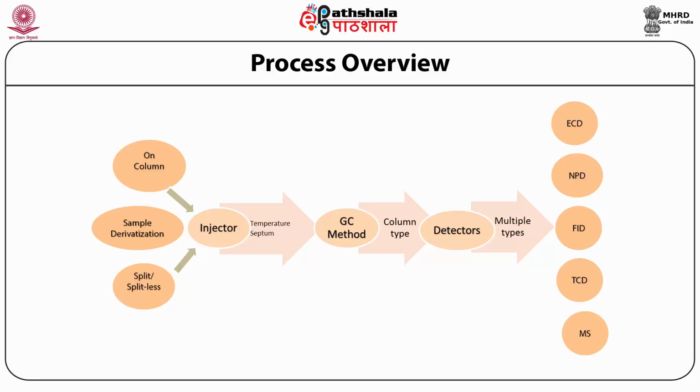Now, the sample then goes into your injector chamber, the injector that is written in front of you. And depending upon the injector temperature and septum, these things have to be finalized before your protocol or your methodology is put into practice.